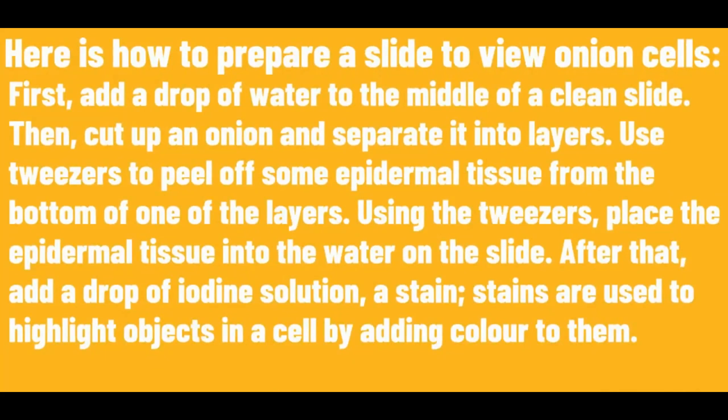First, add a drop of water to the middle of a clean slide. Then, cut up an onion and separate it into layers. Use tweezers to peel off some epidermal tissue from the bottom of one of the layers. Using the tweezers, place the epidermal tissue into the water on the slide.